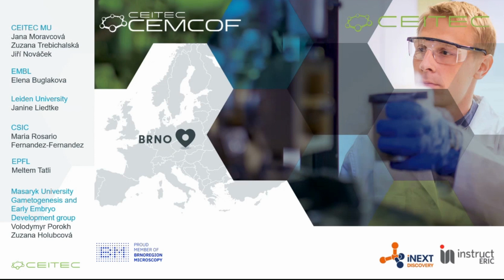In terms of imaging properties, all the data you saw were acquired under more or less the same conditions: 1 kV and 25 or 13 picoamps, some high line integration, low delta. I believe that for brain, for example, if you played around a little bit, you could probably optimize it a bit better. Regarding sample preparation, you have to choose the right cryoprotectant, and that's it. That's great. Thank you so much.